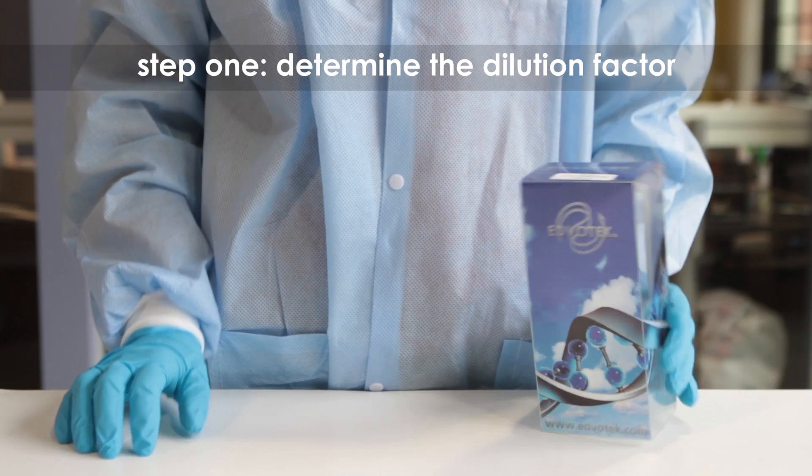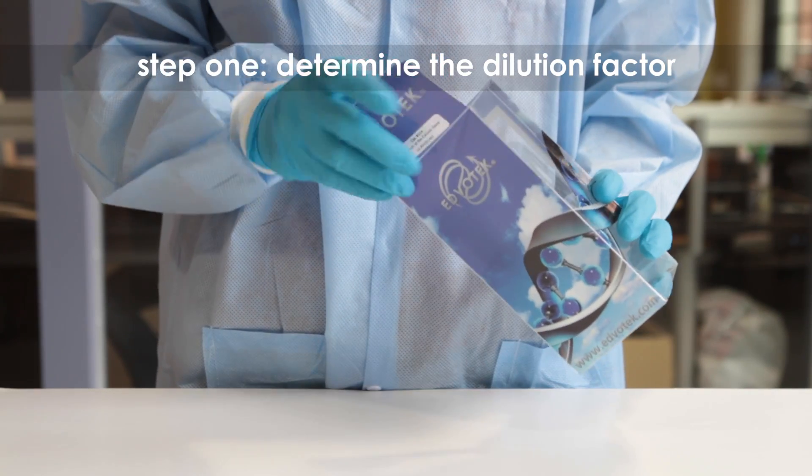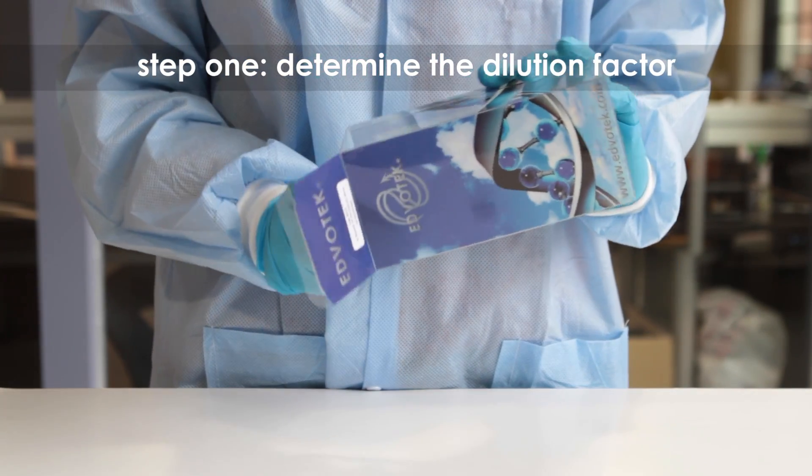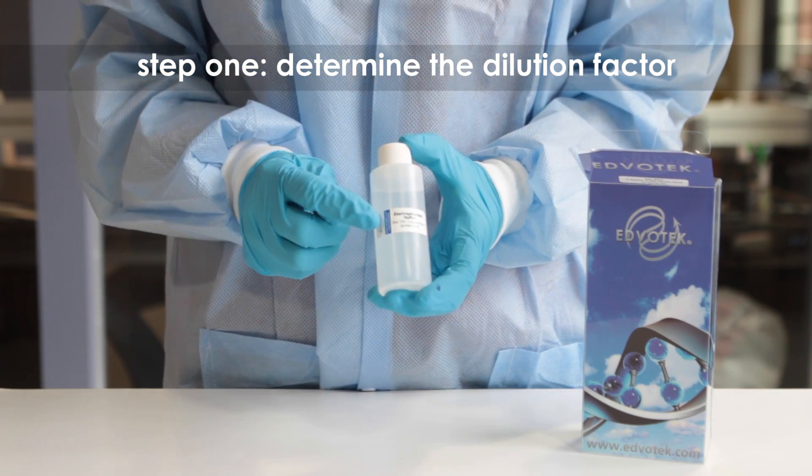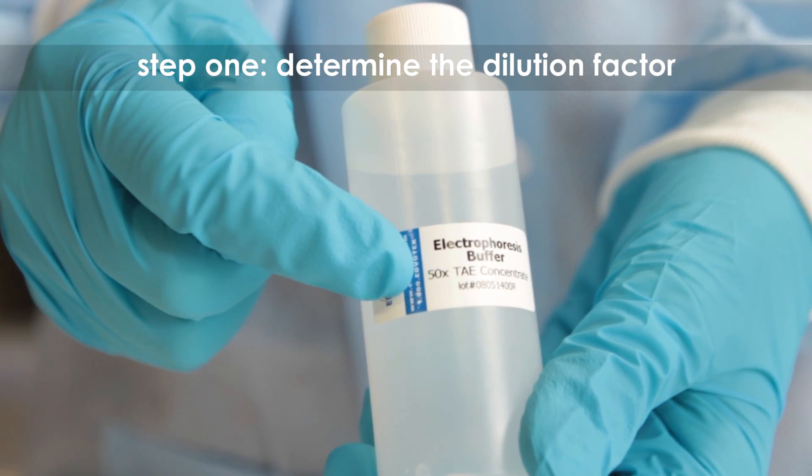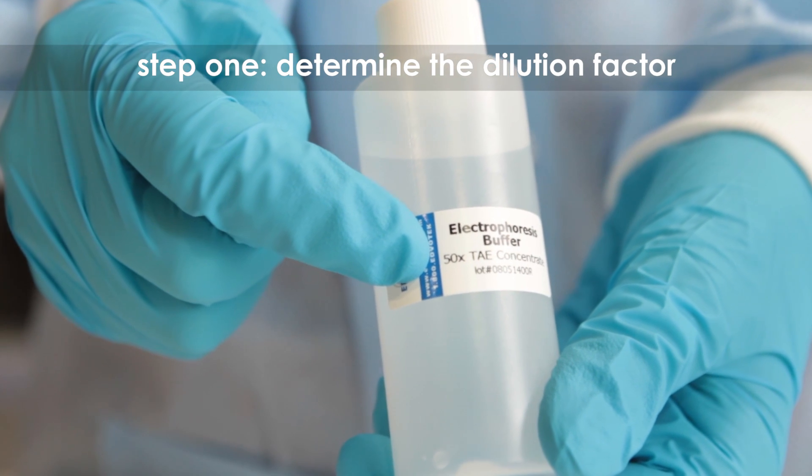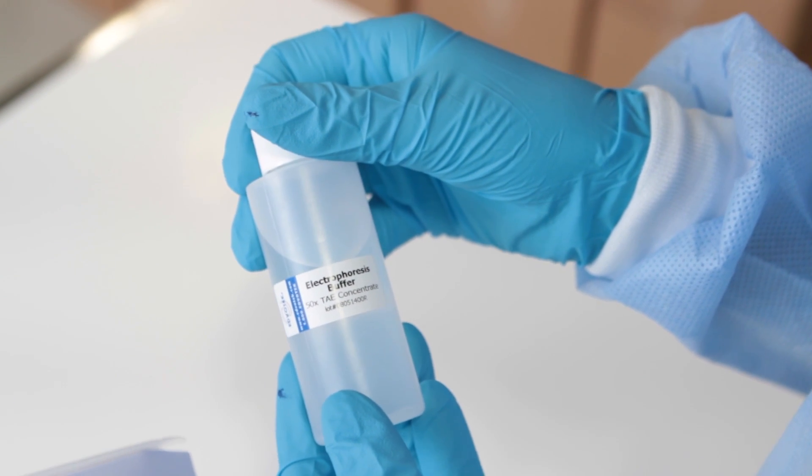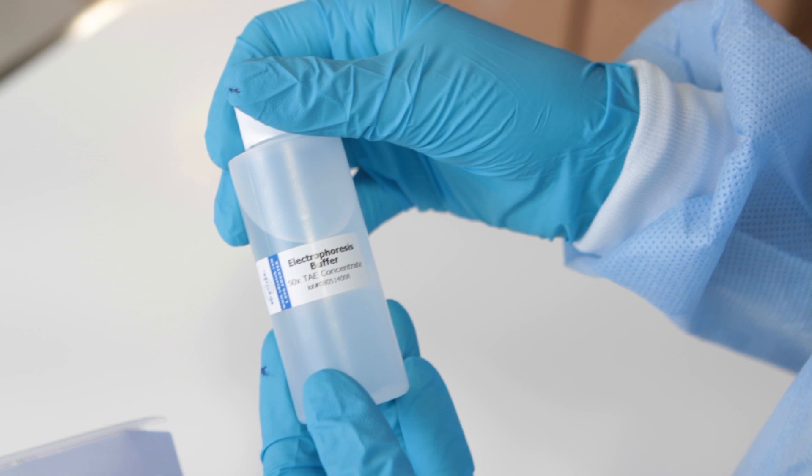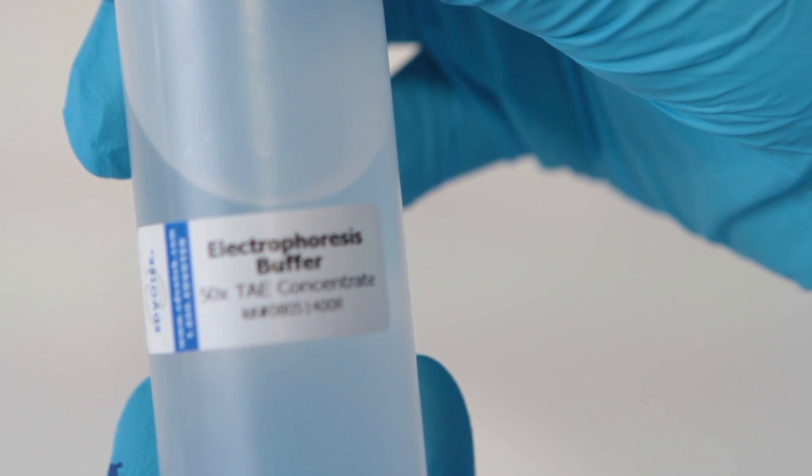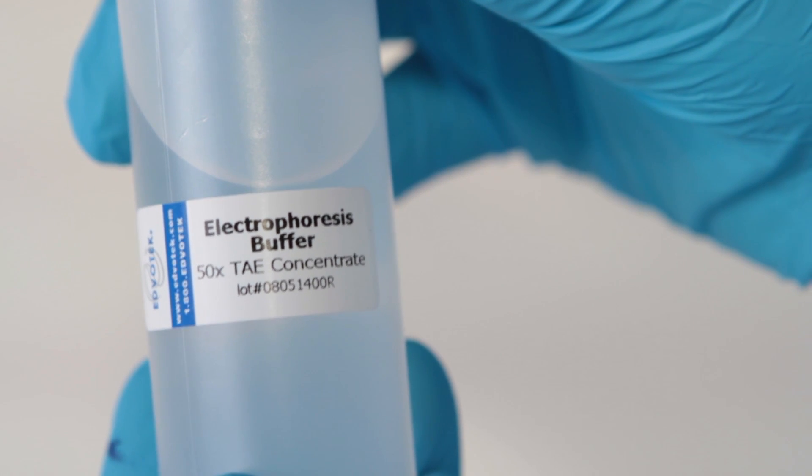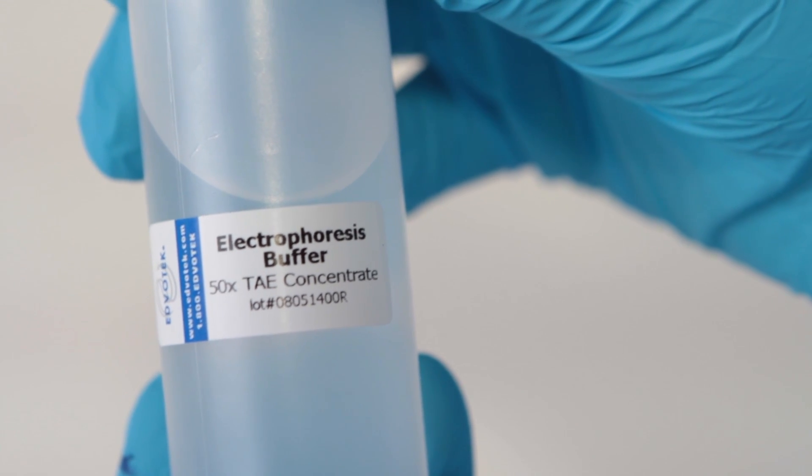Step 1. Determine the dilution factor. Let's say you need to prepare 1 liter of diluted or 1x TAE buffer for your electrophoresis experiments. However, your Edvotech kit contains TAE buffer that is 50x, which is 50 times more concentrated than you need. To get the working concentration of 1x, you will dilute the initial stock 1 to 50.